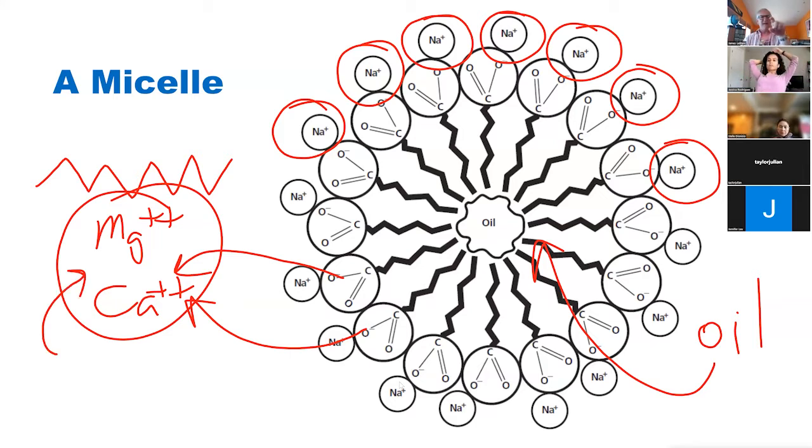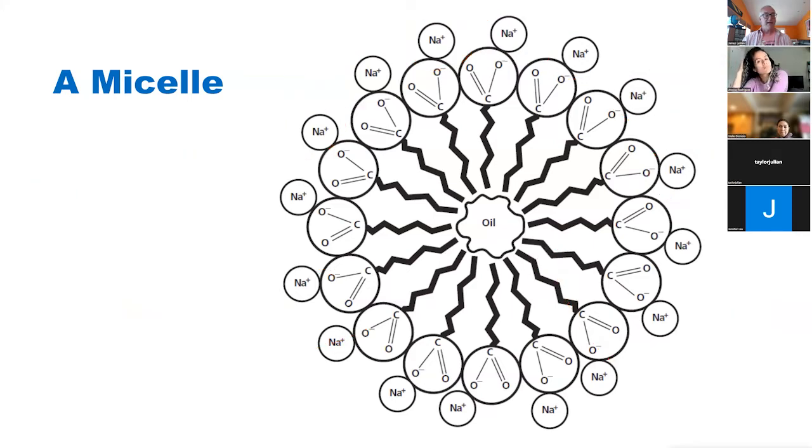It comes as a mixture, it says hard water mixture. It basically has magnesium, calcium, and iron in it. And then we'll see, can it still make micelles to trap the oil in? And I think you should see a fairly dramatic difference. So what are we going to need this afternoon?